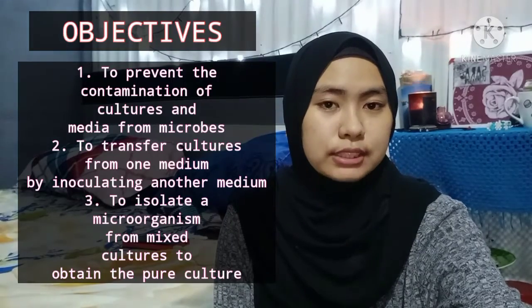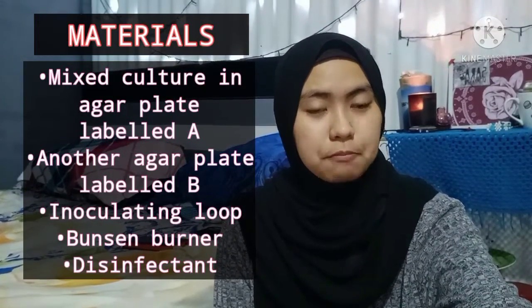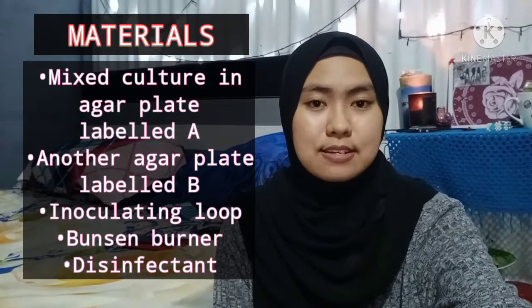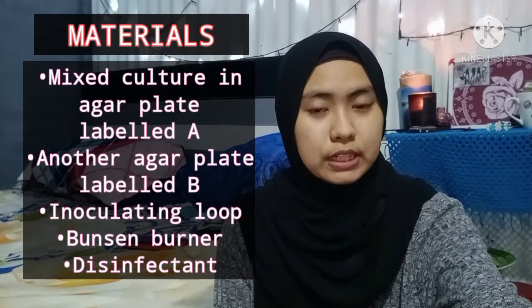Next, I will talk about the procedures of how to transfer the bacteria from one agar plate to another agar plate. Before that, let me introduce the materials needed in this experiment, which are the mixed culture of bacteria on an agar plate labeled A, another agar plate labeled B, an inoculating loop, agar gel, a Bunsen burner, and table disinfectant.